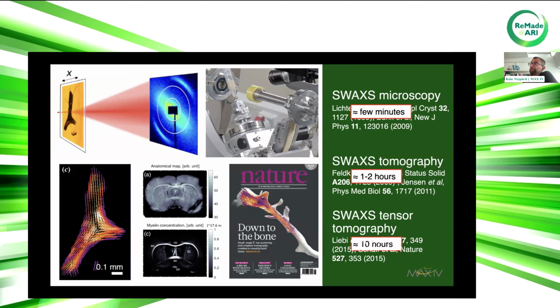So you can still manage to do SWAXS microscopy in 2D if you want to do something in situ. When you go to three dimensions or higher, then these are static experiments. At least today.